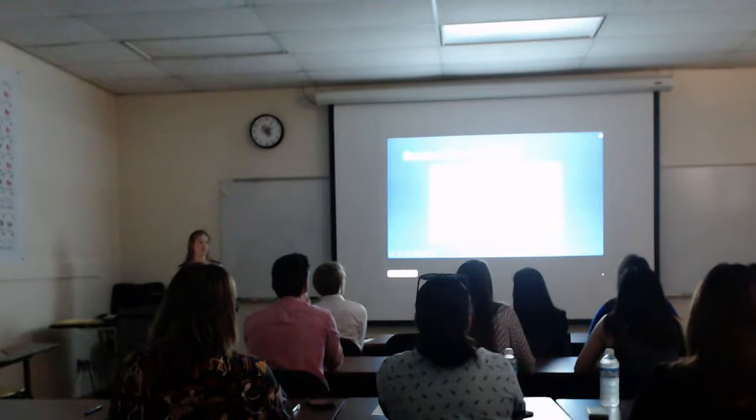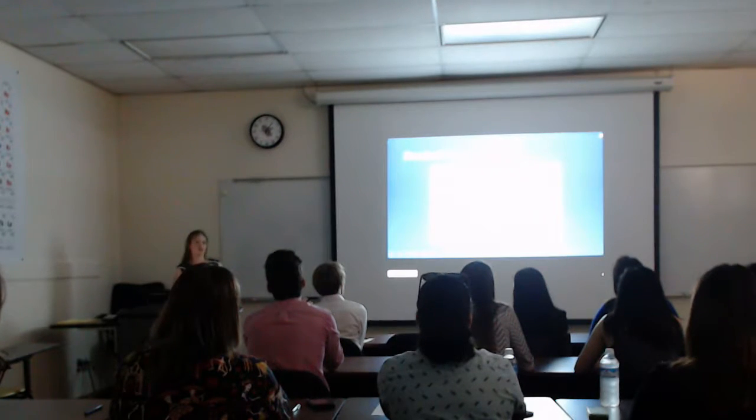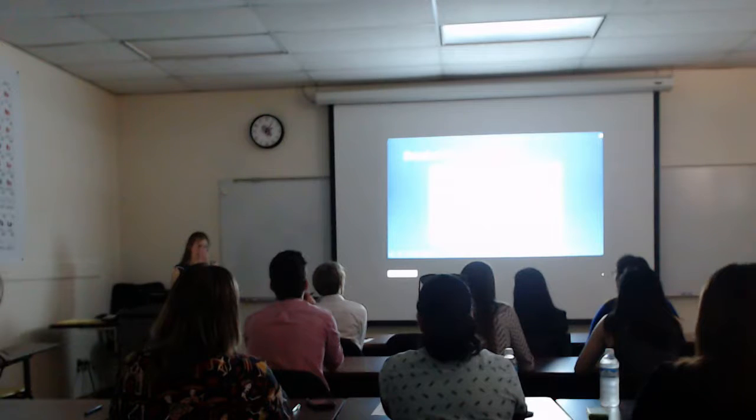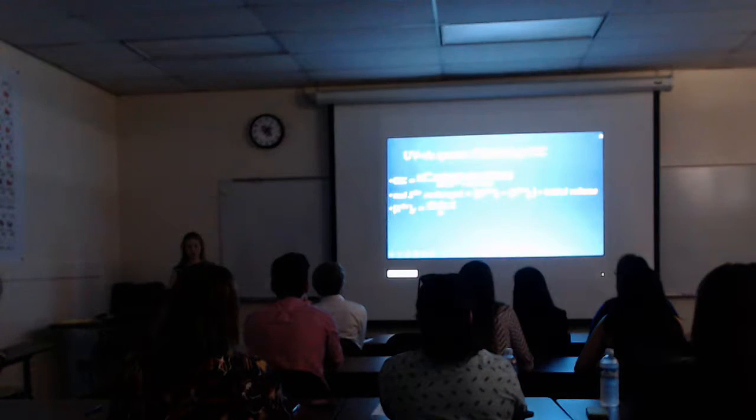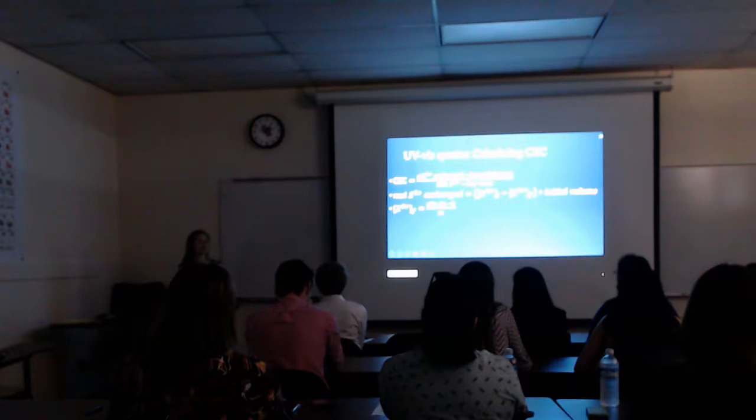This is the standard curve that we produced, and it allowed you to take the absorbance of your analyte to determine concentration, to then determine the cation exchange capacity. Again, this is very simply the concentration of the leftover ion based on the absorbance and slope-intercept form, which you then use that final concentration to back calculate how much was actually exchanged by the clay. The amount exchanged by the clay is then used to determine CEC.